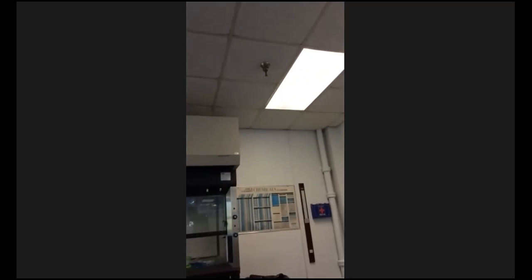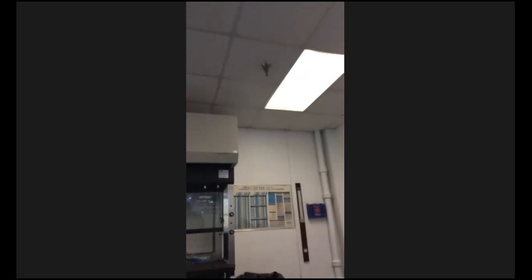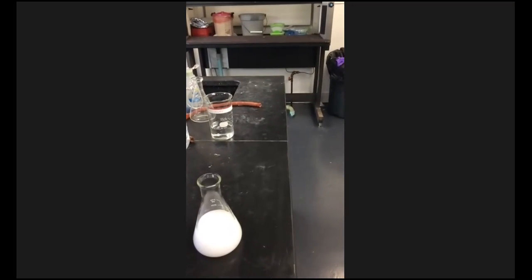So that's precipitating out nicely, and we're gonna let that sit and rest, because a lot of times when you're making crystals or when you're doing precipitation, one of the keys is to let the solution rest. If you keep agitating it, then those crystals are not gonna form and it's not gonna precipitate like it's supposed to. How much time we got left?